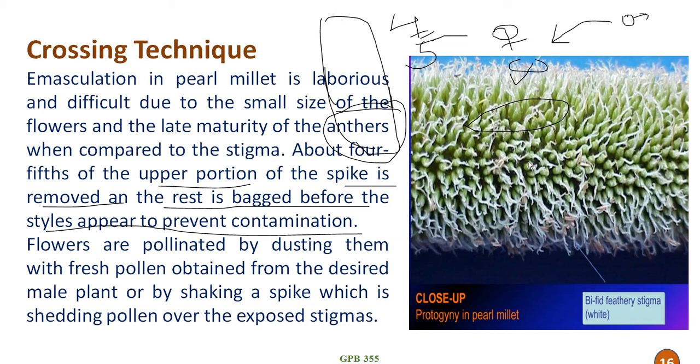And by bagging, we can prevent contamination by other pollen.